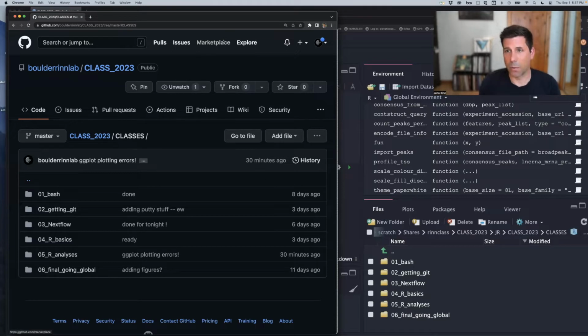cluster them. So previously, we clustered our ChIP-seq data by what type of promoters they overlapped, how similar the promoter overlaps were. And now we're going to cluster them by how they bind across a promoter window of 2 kb. Okay, so let's get started.